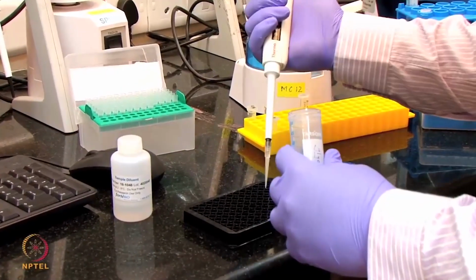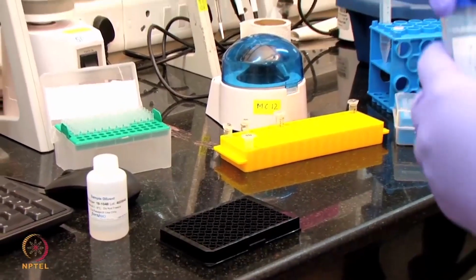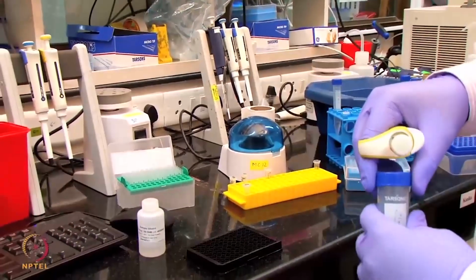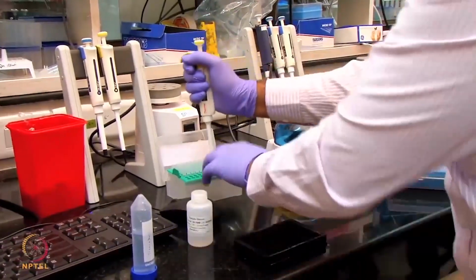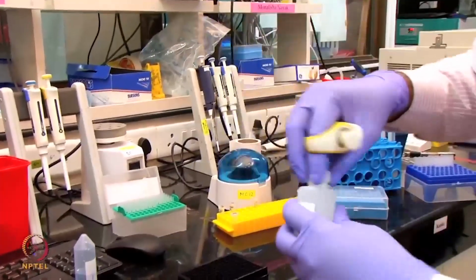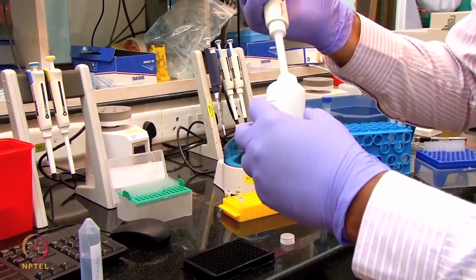The bound apolipoprotein will be washed when the sensor dips into this acidic buffer. We also have to place one more, which we call a neutral buffer, that is this PBST buffer. I'm going to place this one at A12 and B12.